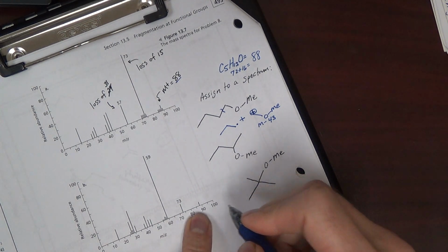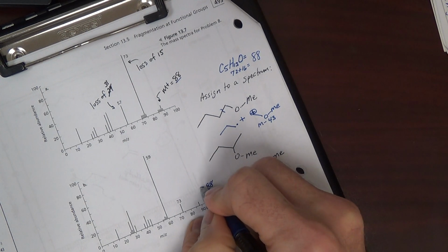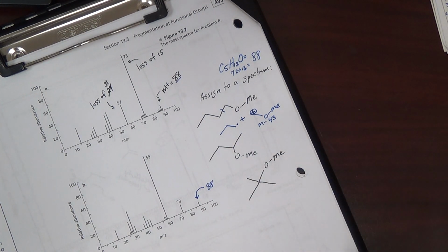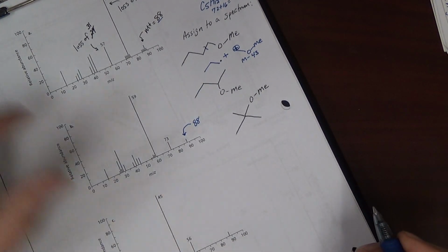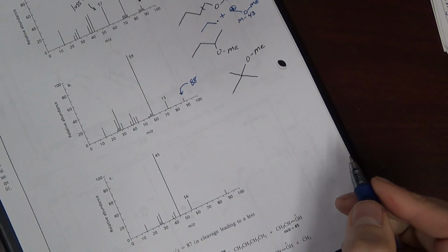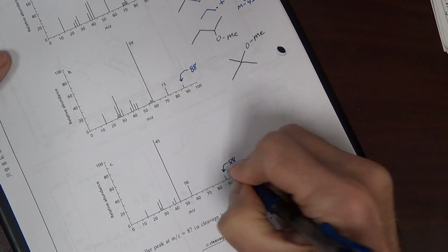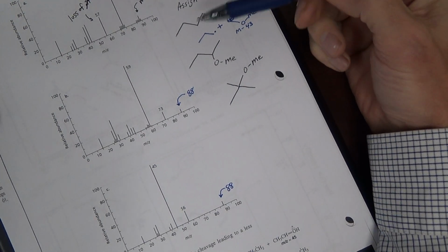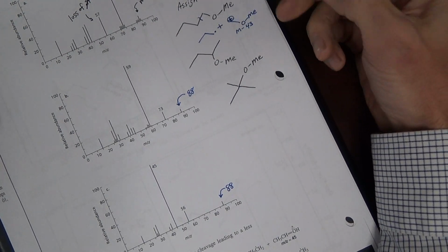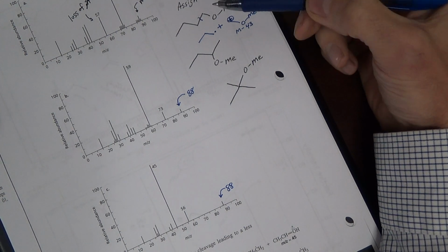But down here, this mass spectrum also shows an 88, as well as the one on the bottom, the last one. So we're not going to be able to use 88 to help us get the answer here. We're going to have to look at cleavage. And that's typically what you're going to need to do.